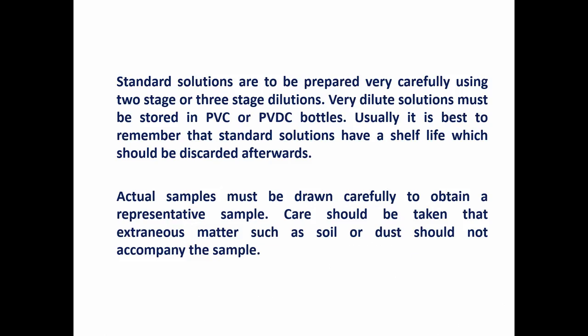Now, there is another problem with very dilute solutions. If you use glassware, the substance may get adhered or adsorbed onto the glassware and it will not be in solution.